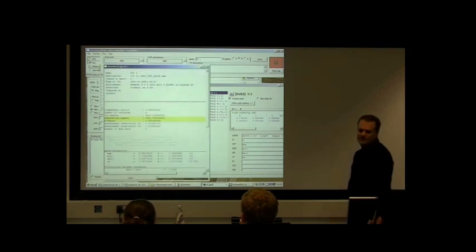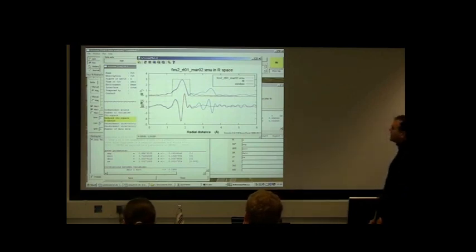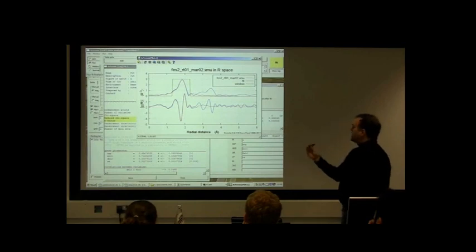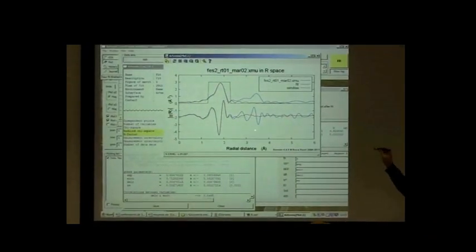Let's look at the plot. So here's a cool thing. Here's the result of the fit, and it's plotted in the magnitude of chi of r and the real part of chi of r, just because it's useful to look at both. I find it's useful to look at both. So this is the default after a plot fit, to look at the magnitude and the real part. And visually, it appears to be a good fit.